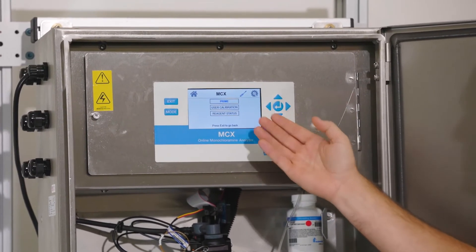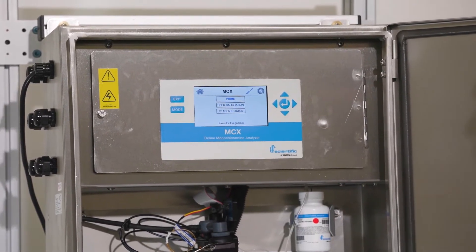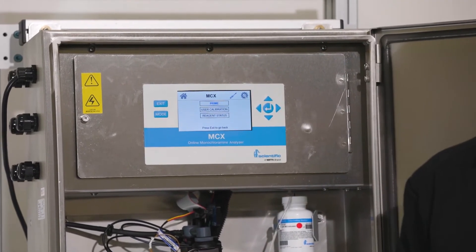This will bring up a Prime option, a User Calibration option, and a Reagent Status option. Just leave the screen as is for the next step.